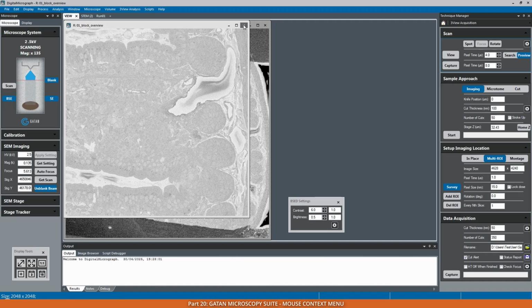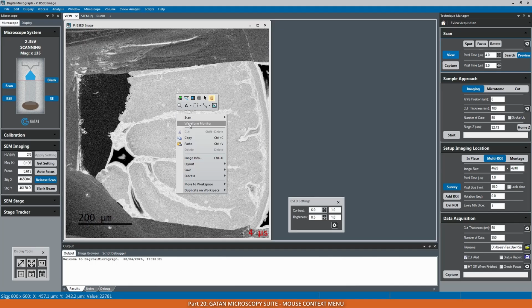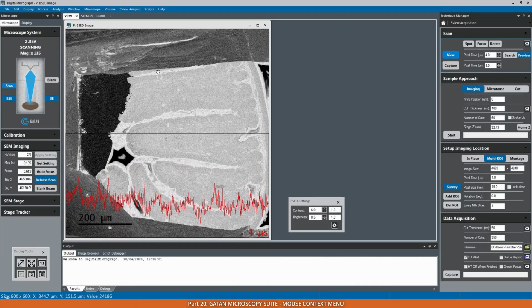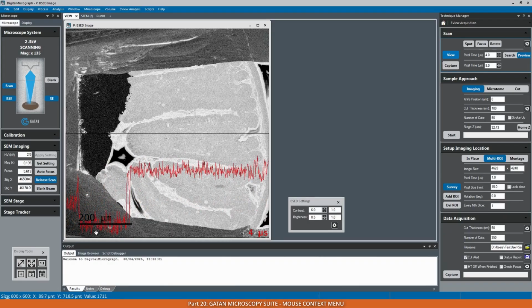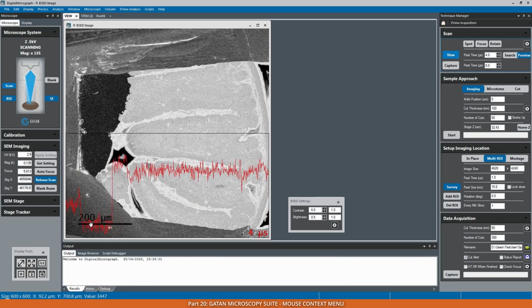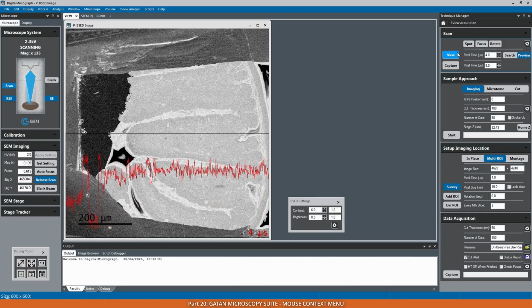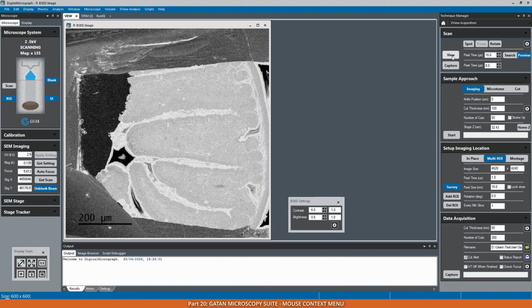Perhaps the most interesting part of this is actually when we are in this preview mode. What you can do, you can turn on this wave monitor. The wave monitor shows you intensity, so basically, while it scans, it shows you the intensity of the signal. The bottom line here is the black, so when it's down there, it means that this scanning line goes over this dark area. That actually makes the scan slower. Let's put it at 16 to see it better, and then press the view.